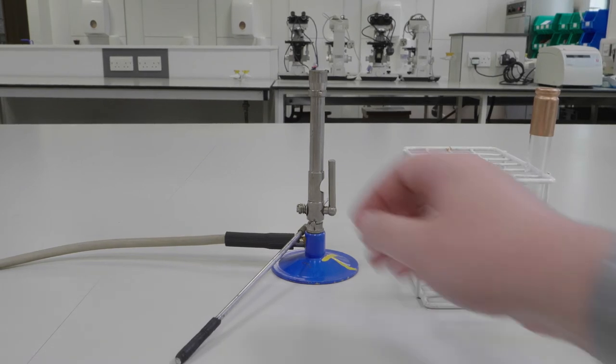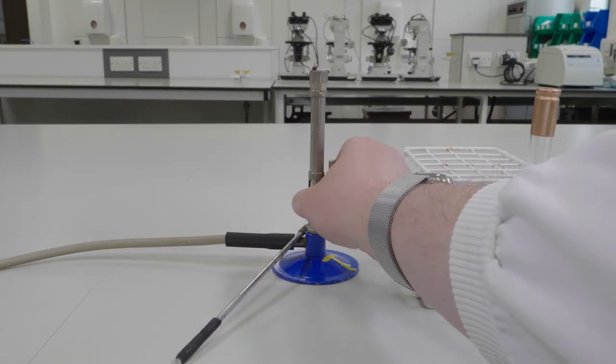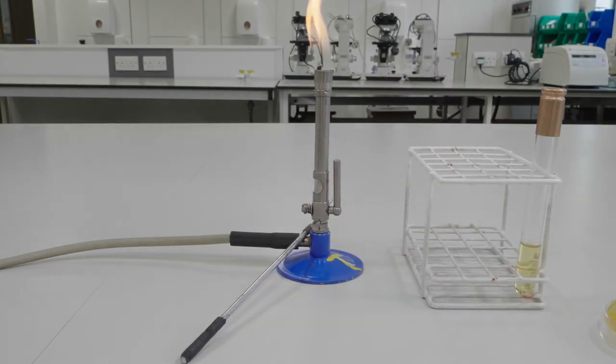And that's it. All you need to do is label your tubes with your initials, date and bench number and place them for incubation.